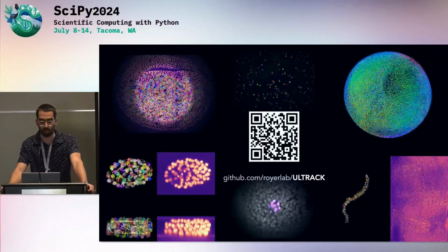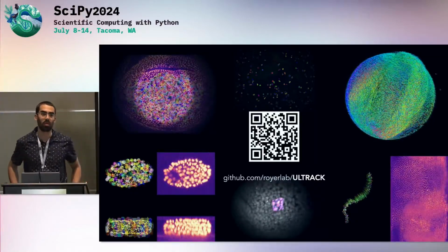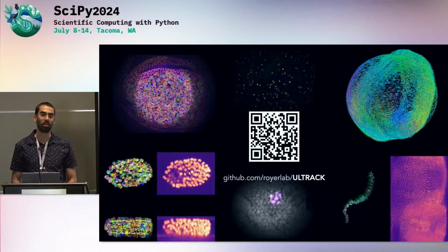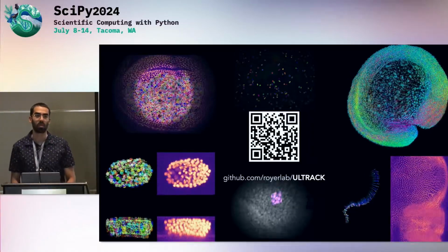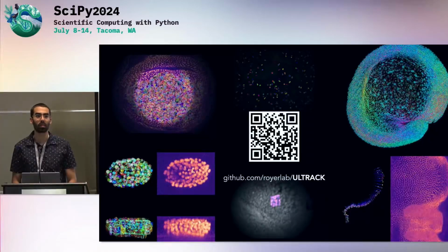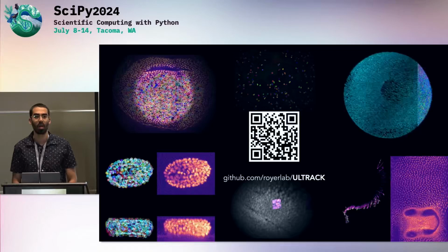One of the steps in your clustering algorithm was that you took the pixels and grouped them together. Would that work for such thin cells? Because the pixels can be so far apart, they could stretch the entire image.